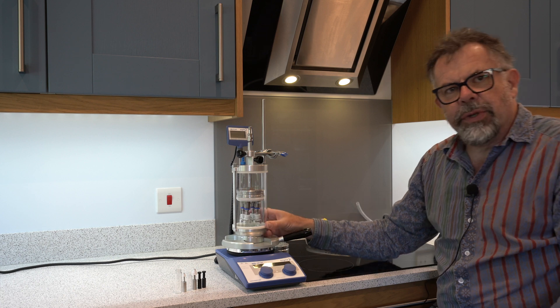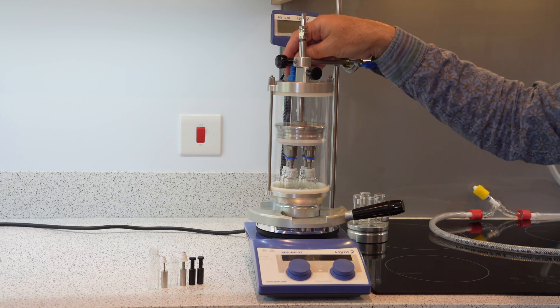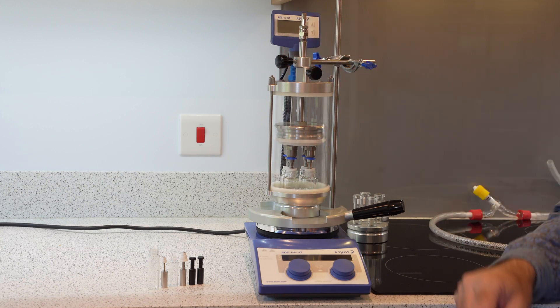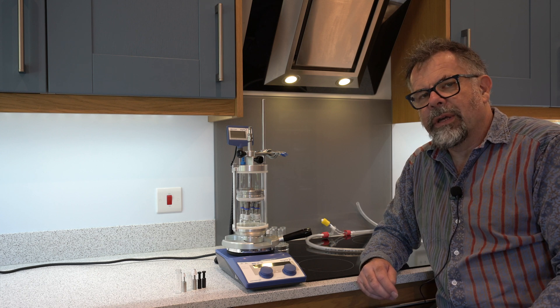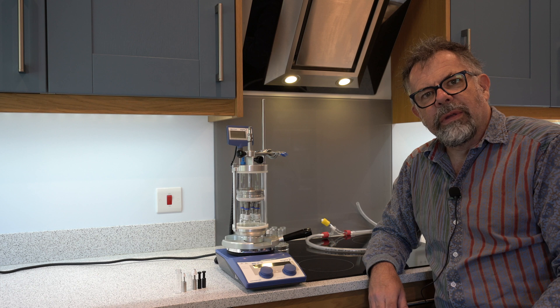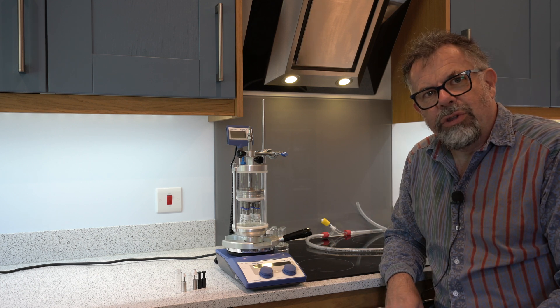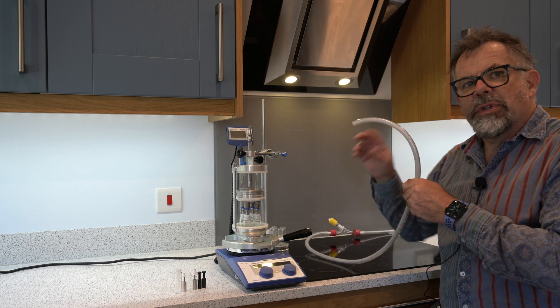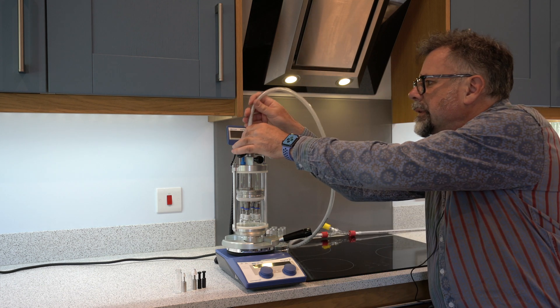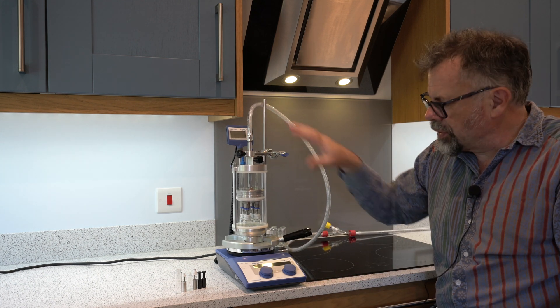The evaporator is completely sealed in the borosilicate glass tube, meaning you can take the exhaust and trap it in a cold trap, or recirculate it through the vacuum pump — if you have a chemistry-suitable pump like VacuBrand — to maintain an inert atmosphere. We have an optional pressure control valve, a glass one which is very nice and easy to keep clean. Now I'll apply a vacuum and we'll do some close-up videos.